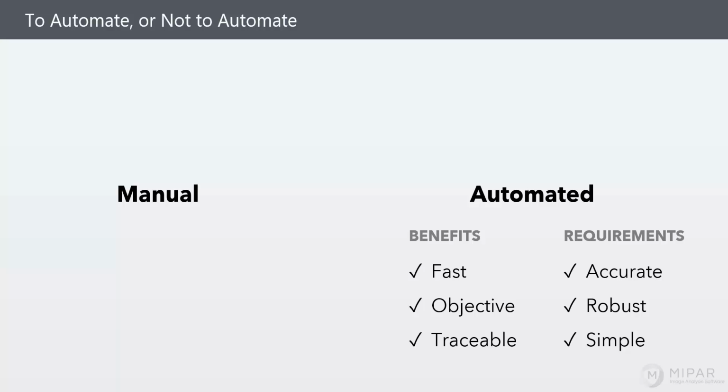Almost always, we need a solution in an automated sense that is as accurate or better as what we've been doing by hand. That solution can't just work for one image or one condition. It's got to handle at least a reasonable level of lighting, exposure, sample prep variation, and it can't require a computer science expert to put the solution together and maintain it. It's got to be something that folks that have been characterizing samples historically can move into and develop a solution that can be used throughout an organization.